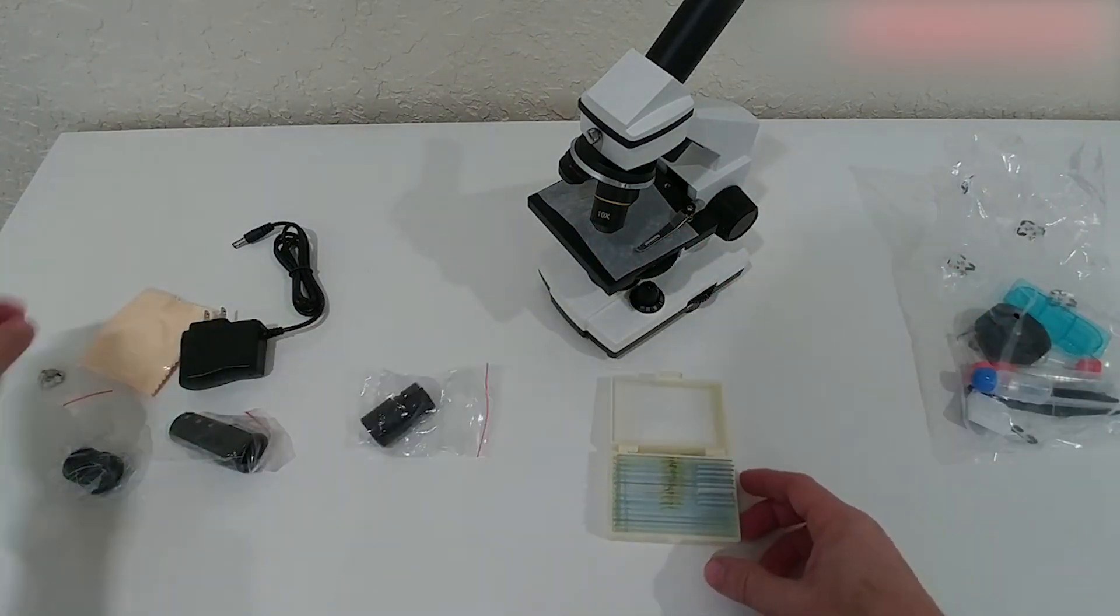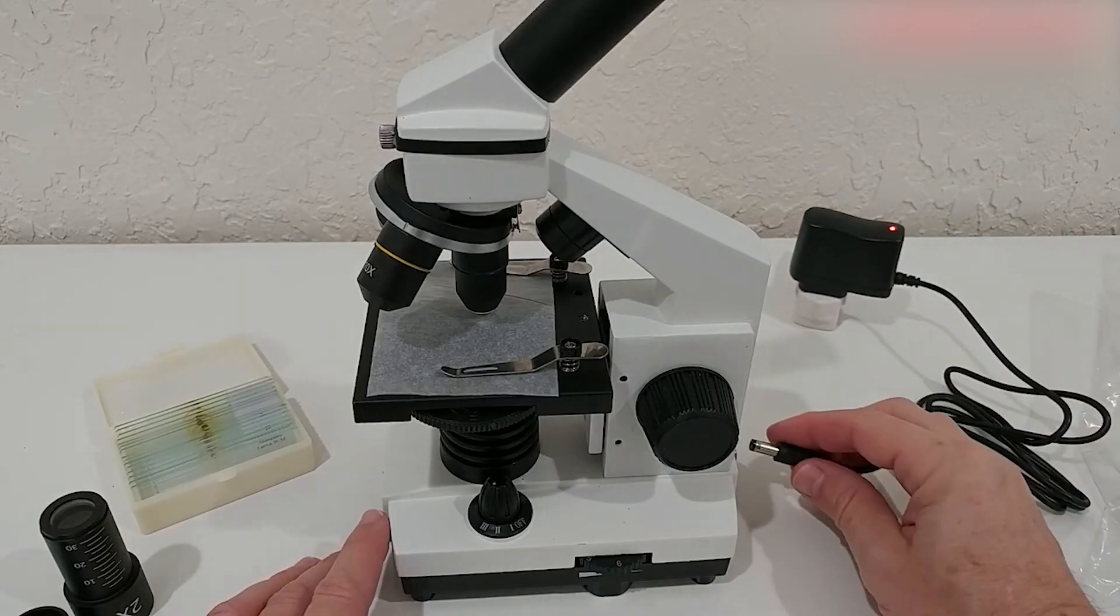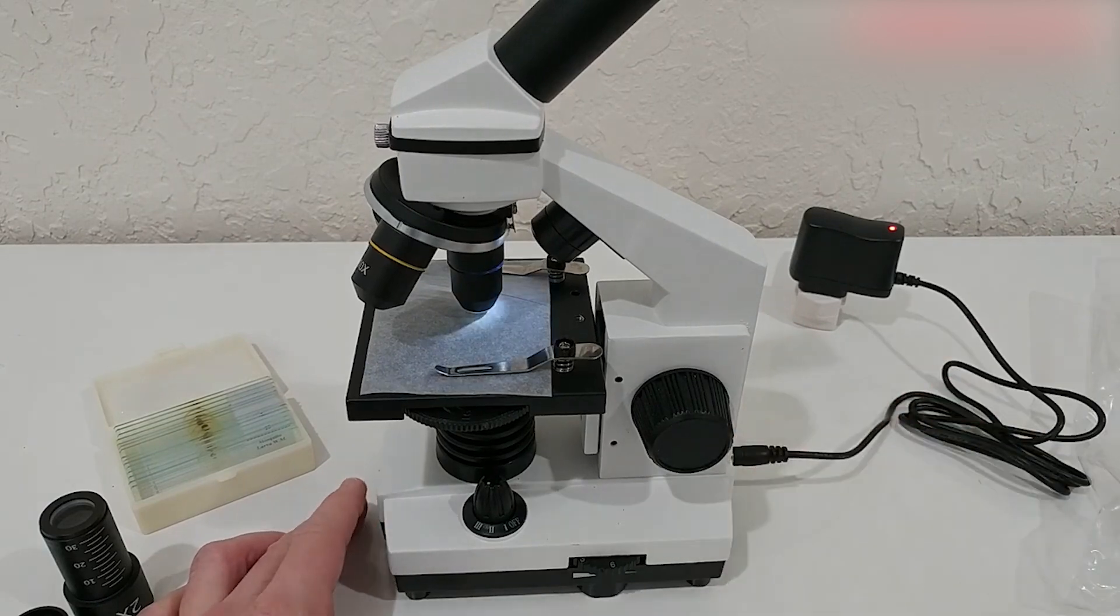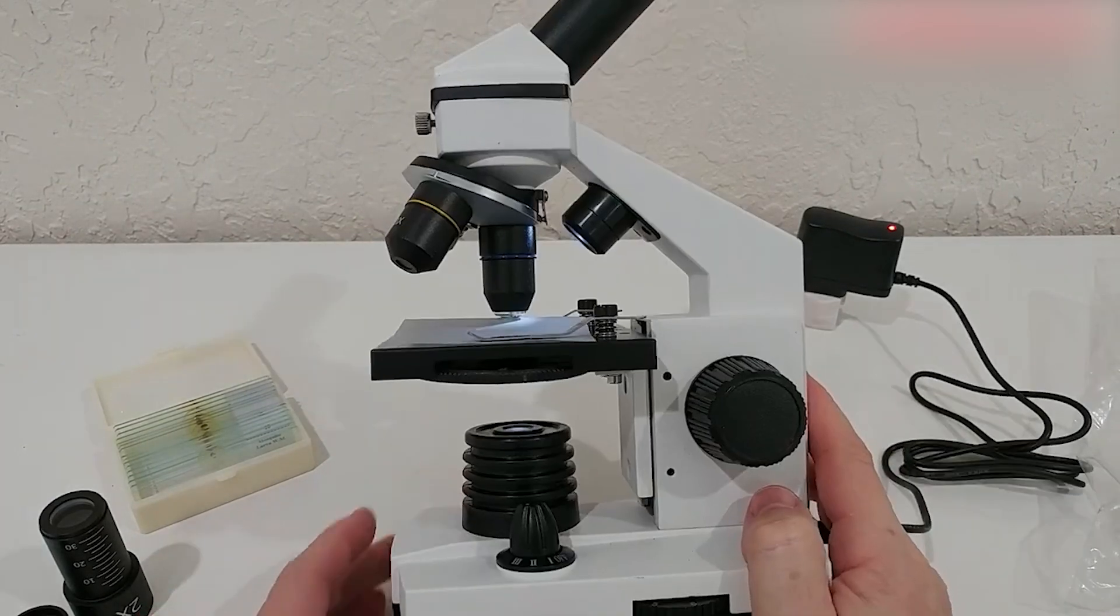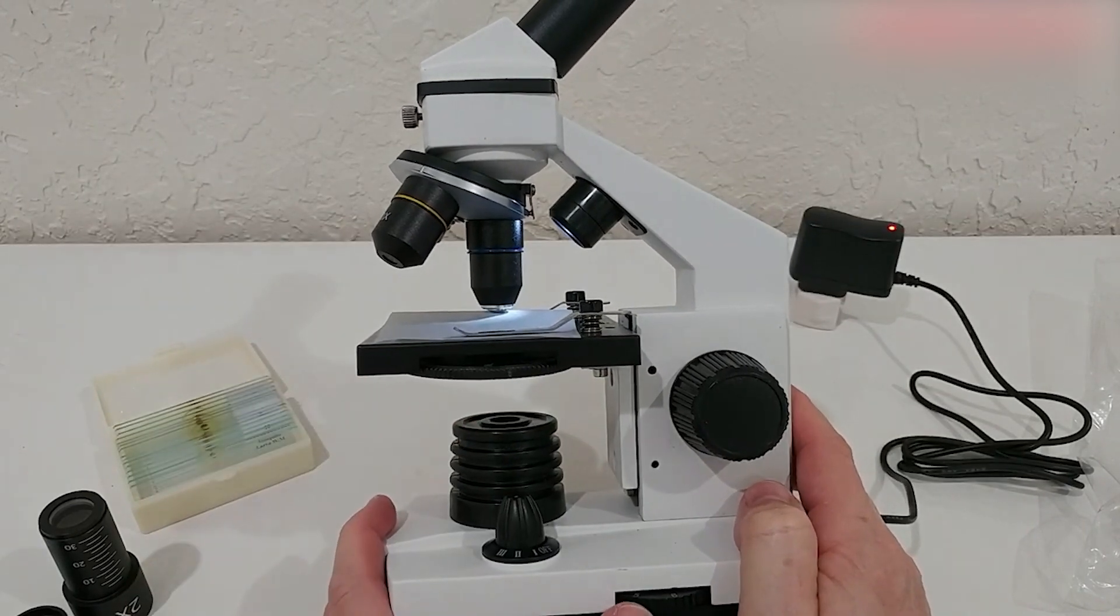But that's not all. The microscope's dual illumination system takes your viewing experience to the next level. With top and bottom LED lights working in harmony in bright field mode, you can illuminate your specimens from both sides for optimal visibility.